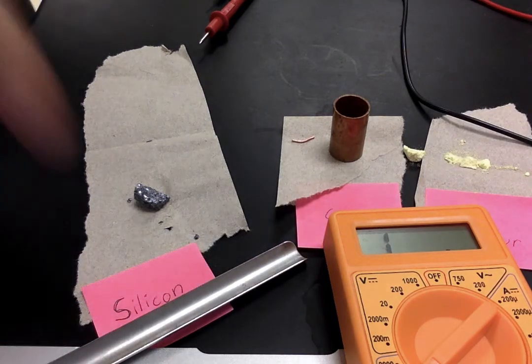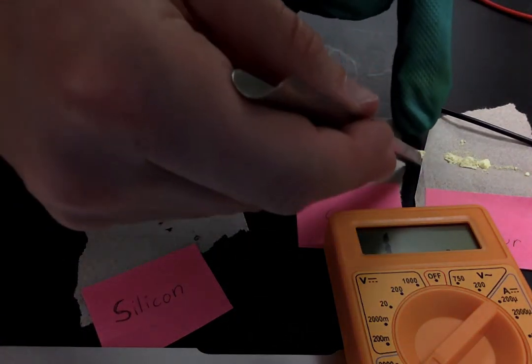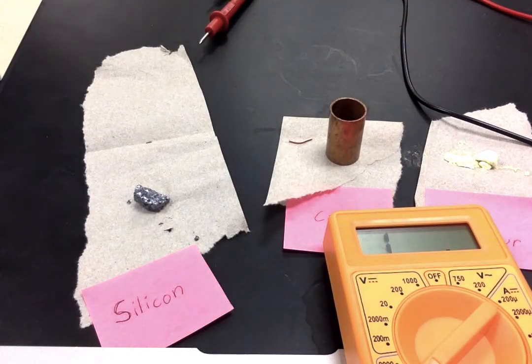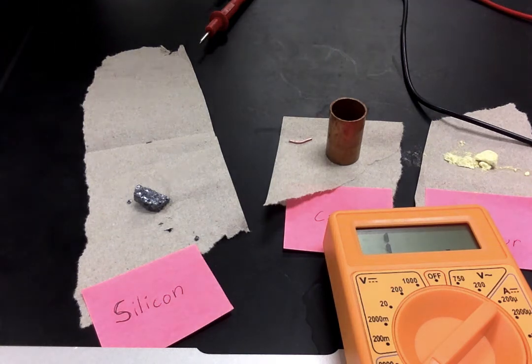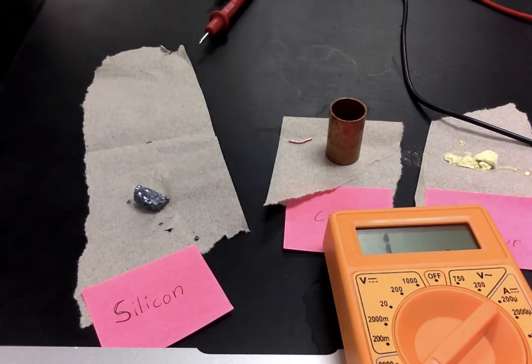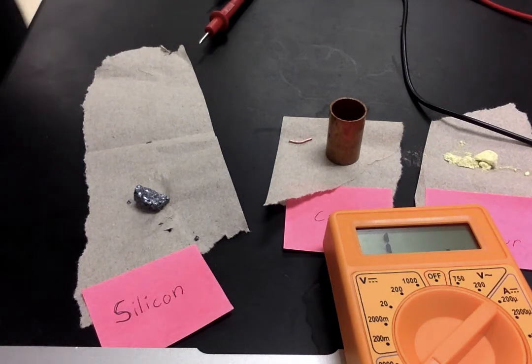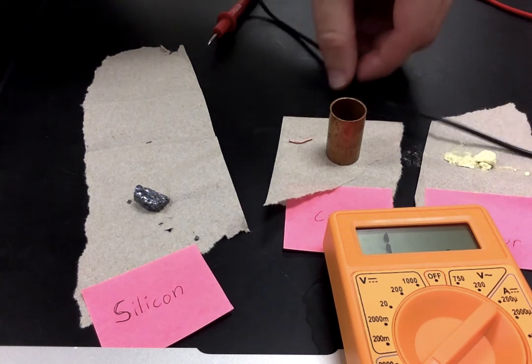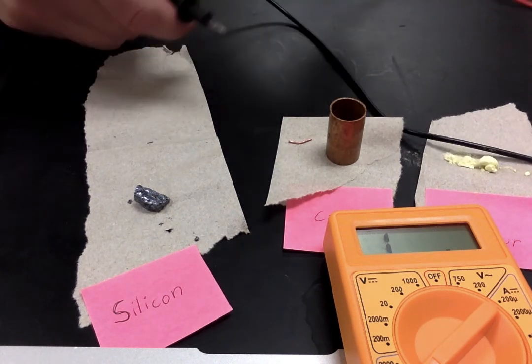Okay, so my sulfur fell off a little bit here, so I just want to put that back on the table. Sulfur's a little bit dangerous. You don't want to touch it. Okay, so let's test them all for conductivity. So first we're going to do silicon.